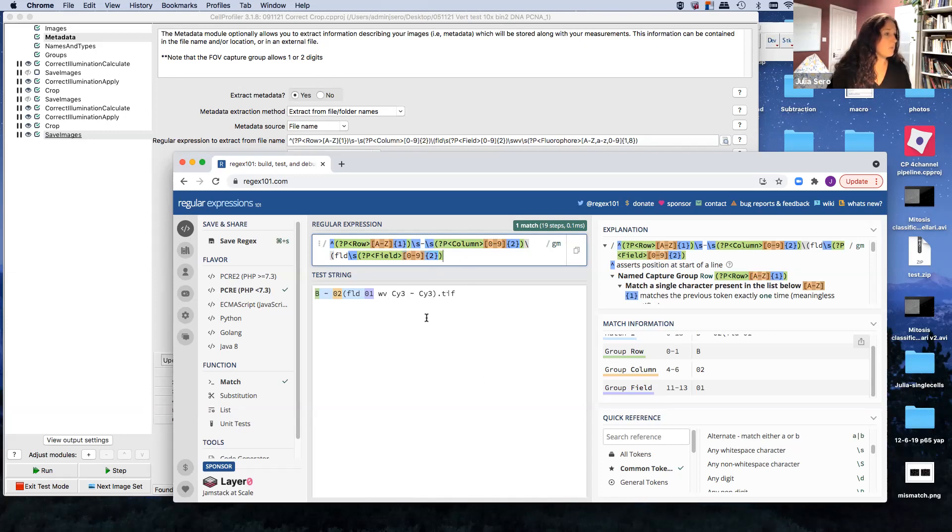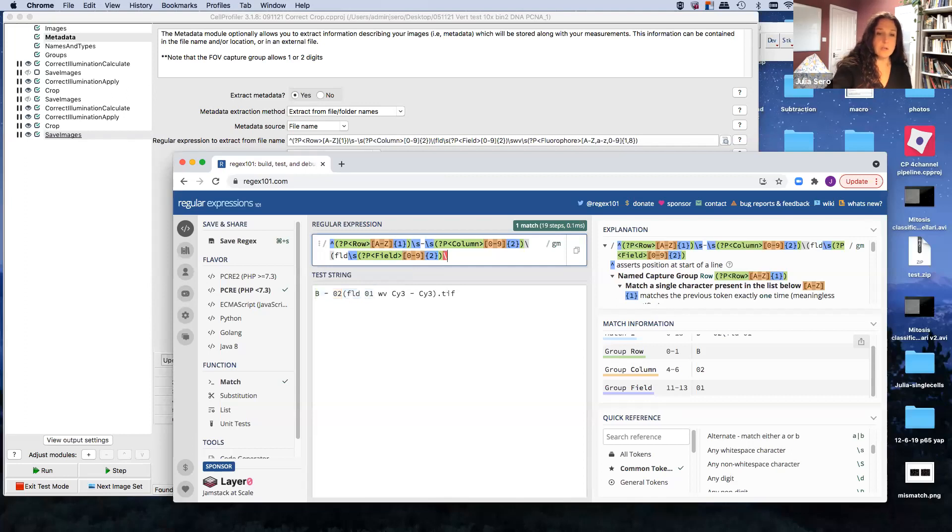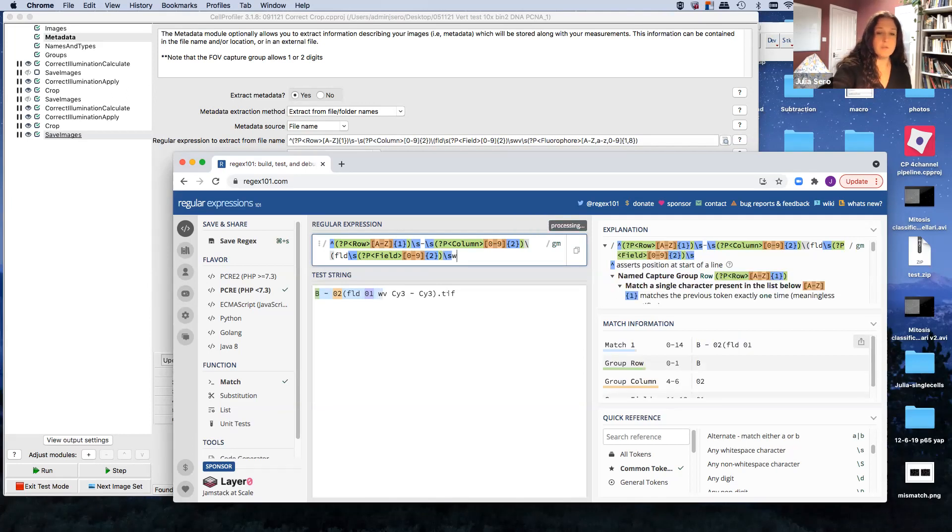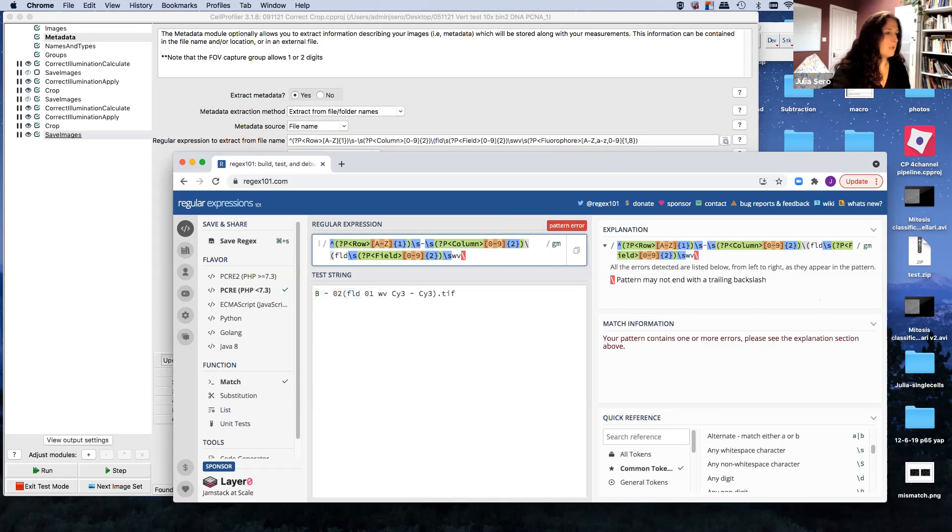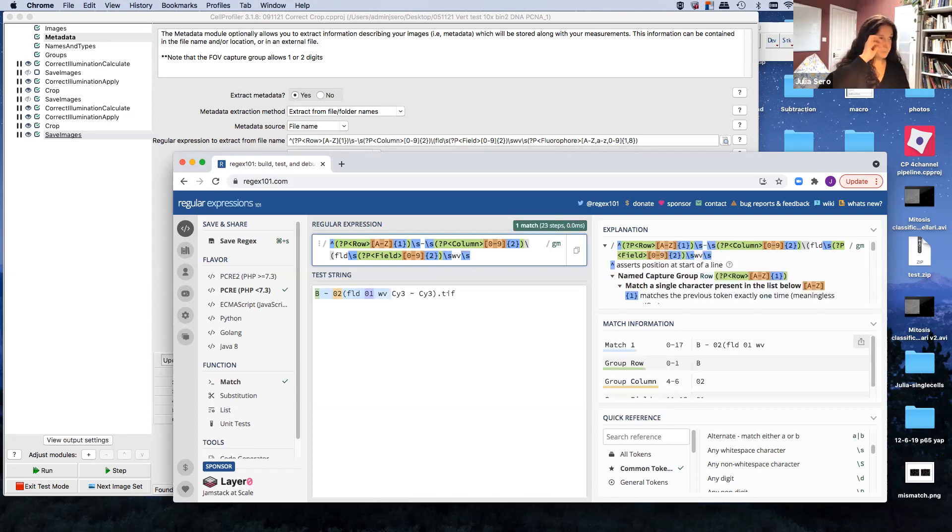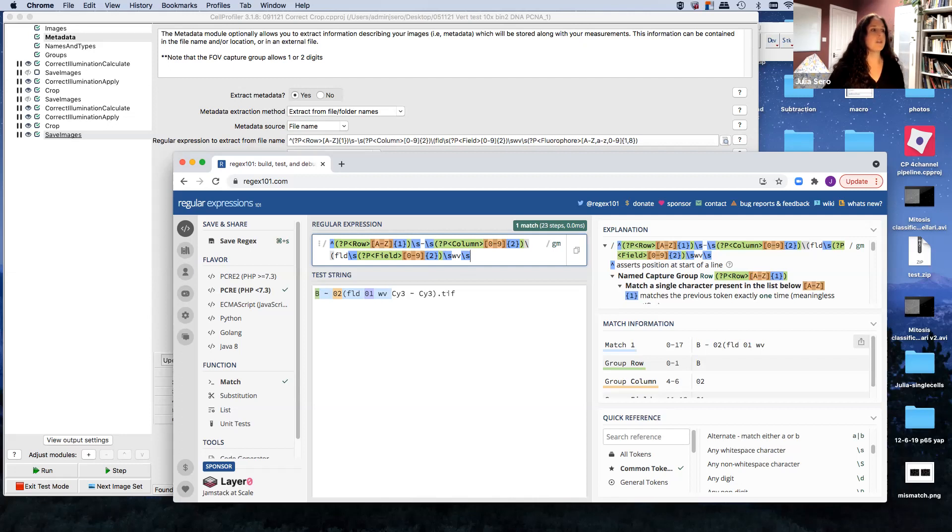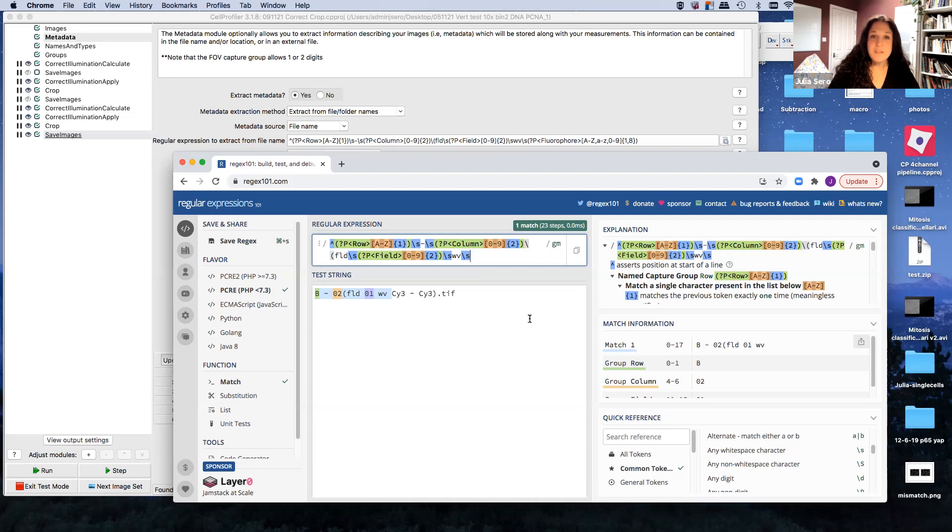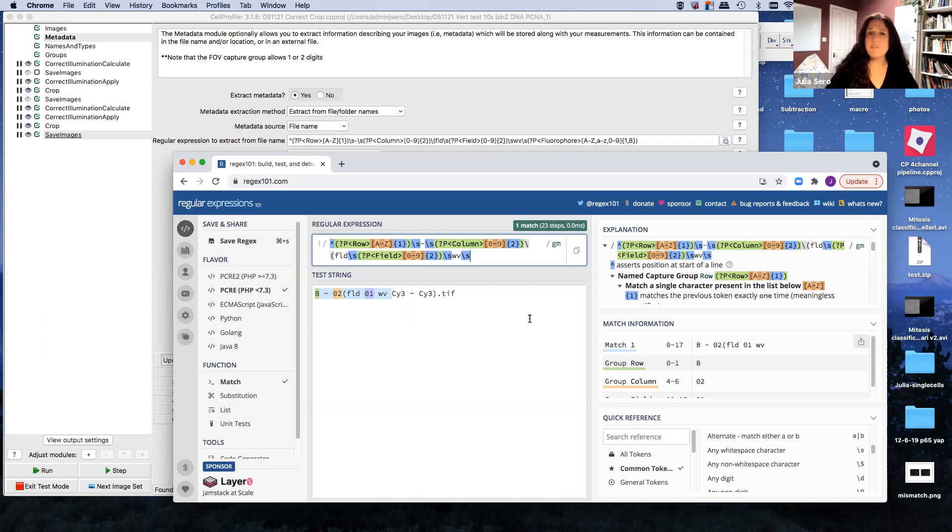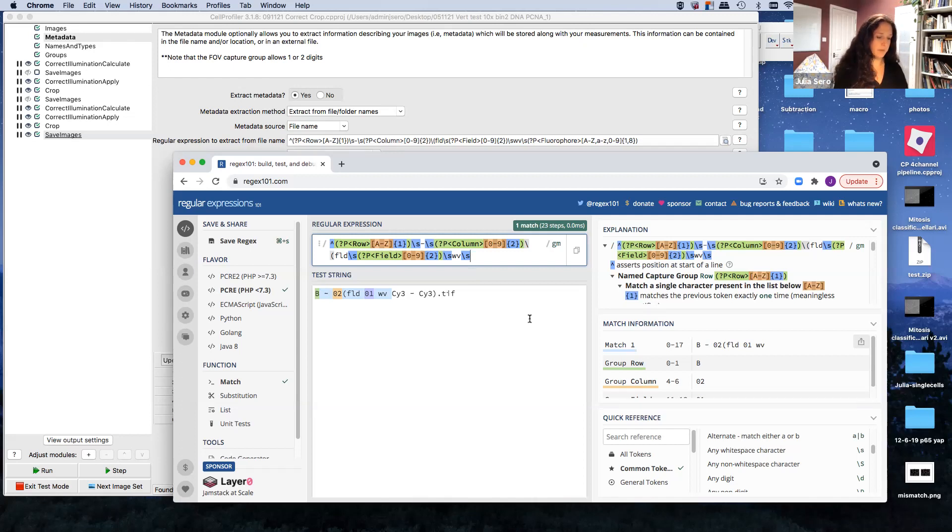Now we've got some more things that we want to ignore. So we've got a space. We've got WV, which I guess in the incel language means wavelength, which it's a strange thing to call that. Maybe it's German. And then here now we want the capture group of our fluorophore. And here's where this gets a little bit hairy because the fluorophore, it could be capital C lowercase y three. It could be all caps DAPI. It could be FITC. It could be bright field. There's a lot of things that it could be. So we want to cover all of our bases here in this capture group.